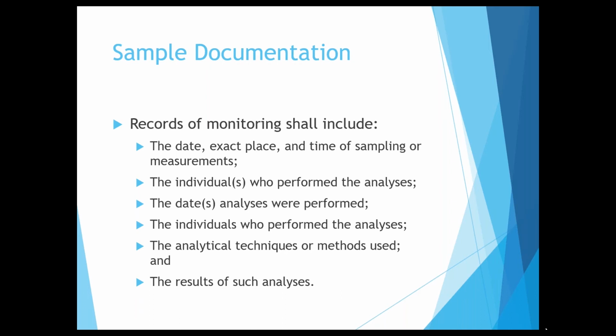So in that case, again, I know that that little tablet on the bottom just likes to wash out instantly. Catch it at the edge. That's a technique that you're going to have to develop for yourself. But I would say just catch it at the edge and try to fill it up slowly. Just take your time. Haste makes waste. My great grandmother always said that, and I've proven that over and over. And I'm sure a lot of you have too. Haste makes waste. All right, let's keep going because we have a 15-minute video and I want to make sure I get you out of here as close to on time as possible.